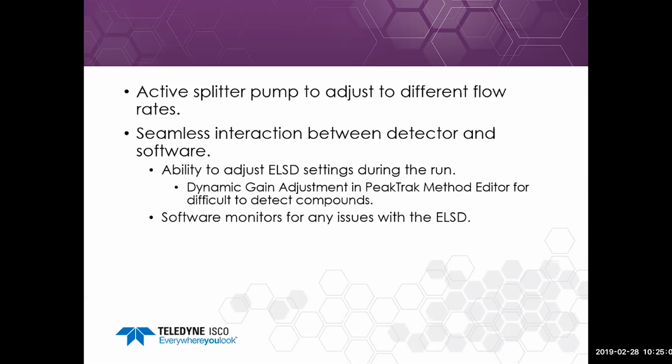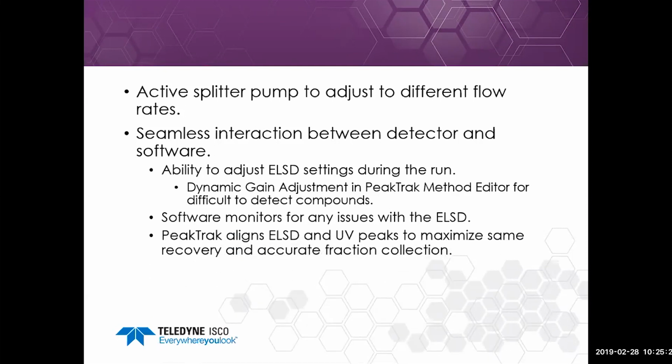The software obviously monitors for any issues with the ELSD. Maybe you ran out of gas for the ELSD, or the drift tube and the spray chamber aren't at the proper temperature. And so those kinds of issues are going to pop up and say, hey, we need to wait for it to get to temperature before we go. So you wouldn't see those issues or problems pop up if you weren't using an integrated software solution for it.